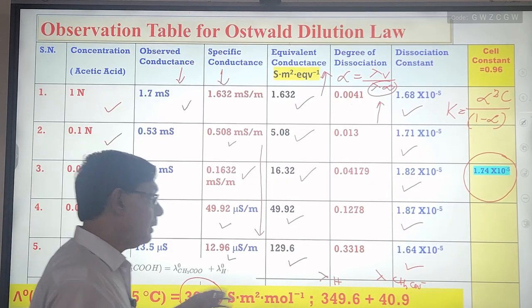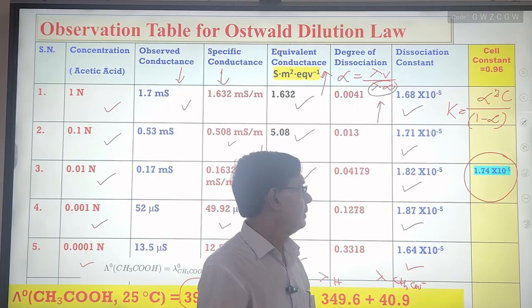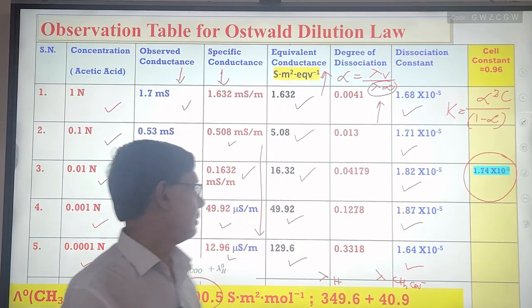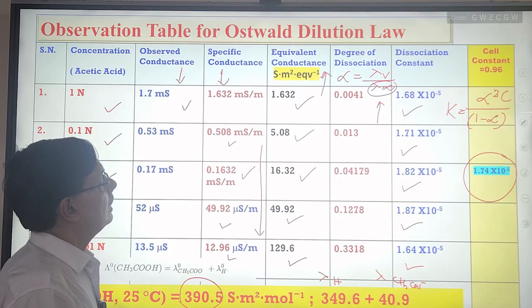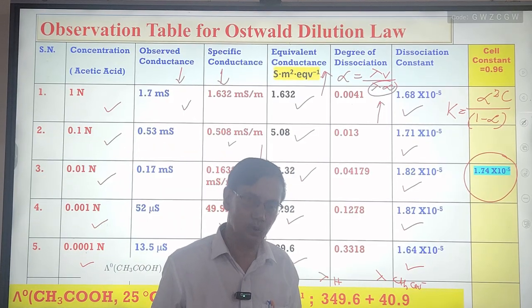Now the last part is that we have to verify this Ostwald dilution law graphically. Again, there are many techniques or systems, and you are all aware of the role of strong electrolyte and weak electrolyte.